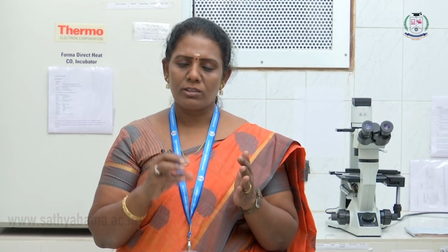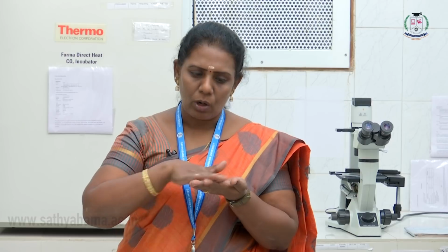It is prepared along with phosphate buffer saline. This has to be added for about 1 ml onto the cells wherever they are present on the matrix, and we have to wait for about 1 minute because this trypsin is toxic to cells. So remove it immediately. We add 5 ml of media, then we go for slow flushing. Slow flushing is another name for trituration.